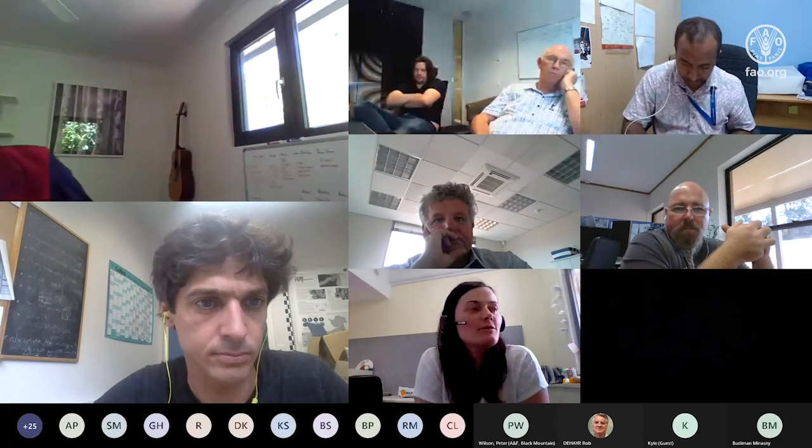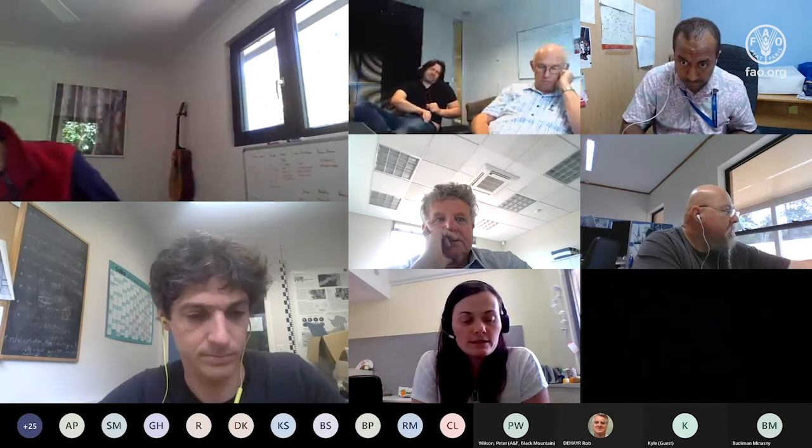Okay, great. I don't have any slides either, so I thought I'd give you just a quick overview of what's happening at the Black Mountain side in our spectral world here. Over the years, we have established the national spectral libraries in the mid-infrared and visible near-infrared space based on the National Soil Archive soil specimen. In our NIR library, we now have accumulated more than 30,000 spectra.